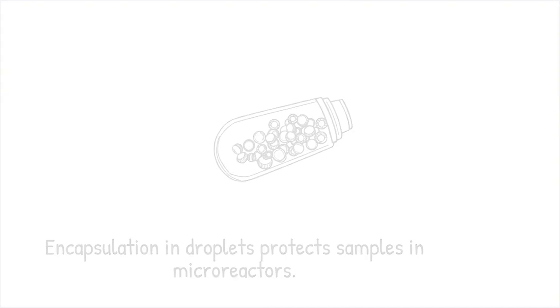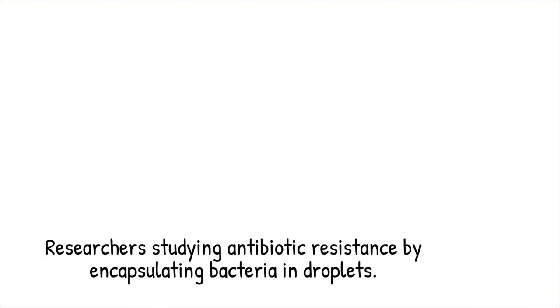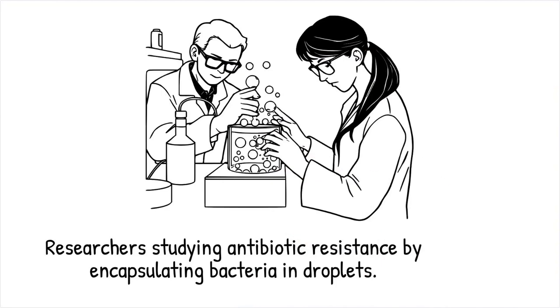Researchers encapsulate single bacteria in droplets to study antibiotic resistance without cross-contamination. It's like storing tiny bubbles in a soap film, each holding a different ingredient safely inside.